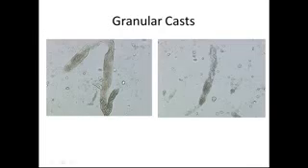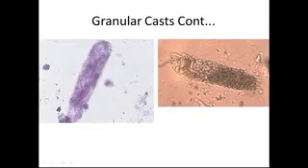So here's a picture of a granular cast. See all those little granules in there. Another picture of some granules. And this one is a fine granule, and this is what we would consider a coarse granular cast.